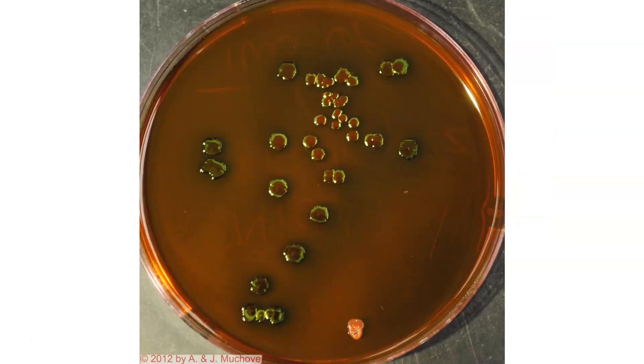If you did it correctly, you will get something like this. On this plate, you can count the individual bacteria. In this particular case, we're looking at E. coli, which gives us that nice green metallic sheen on this EMB agar. Based on that, you would be able to tell how many of these you have per milliliter and calculate it. There's a video on how to calculate it online.